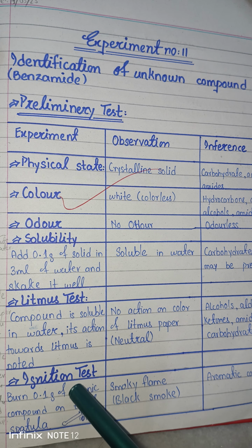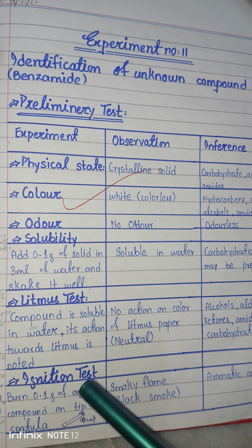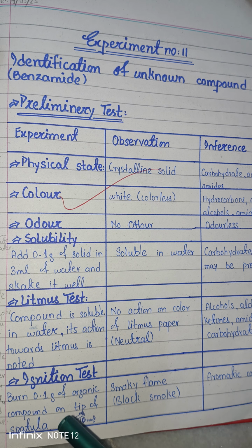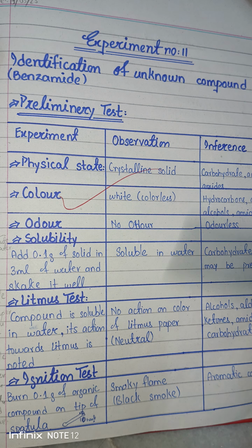Now we perform another test which is the ignition test. The word ignition means to burn an organic compound. You will take 0.1 gram of this benzamide on the tip of a spatula and burn it under the Bunsen burner. Then you note the flame. Two things will be observed. First is whether the flame is smoky or clear. Second is the color of the flame, whether it is white or black.